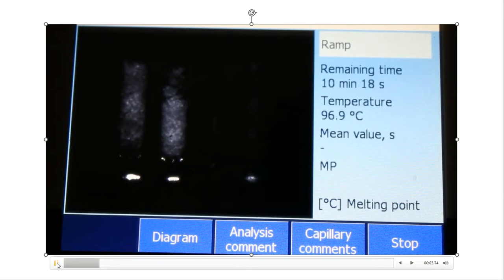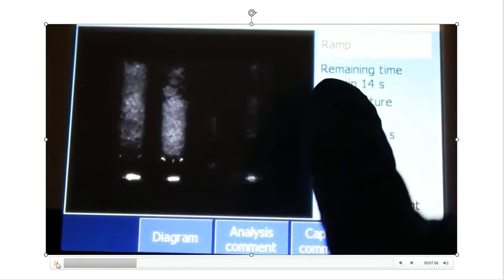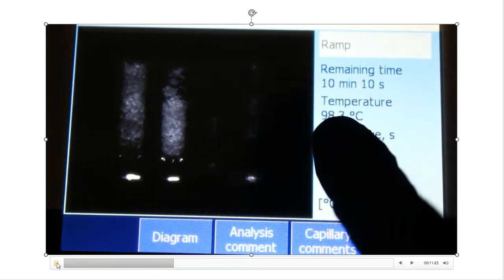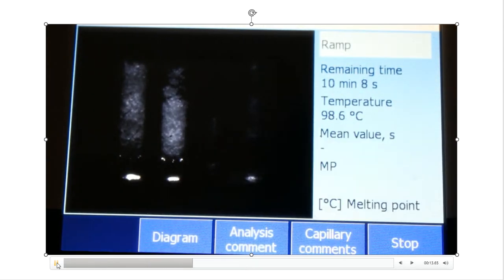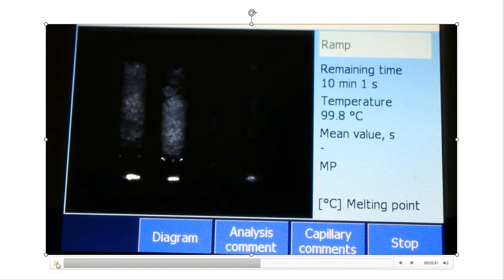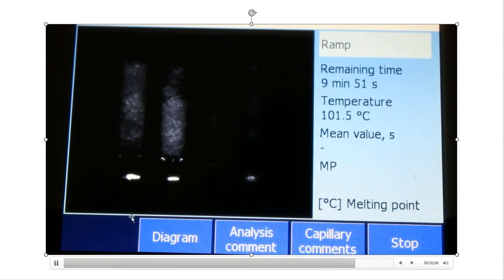Update at six minutes into the process: the crystals are still solid and the temperature is at 98°C Celsius. More heating is still needed. The machine will take over if it needs to, but I wanted to show midway what's happening in the melting point system. At 101°C, they still haven't melted.